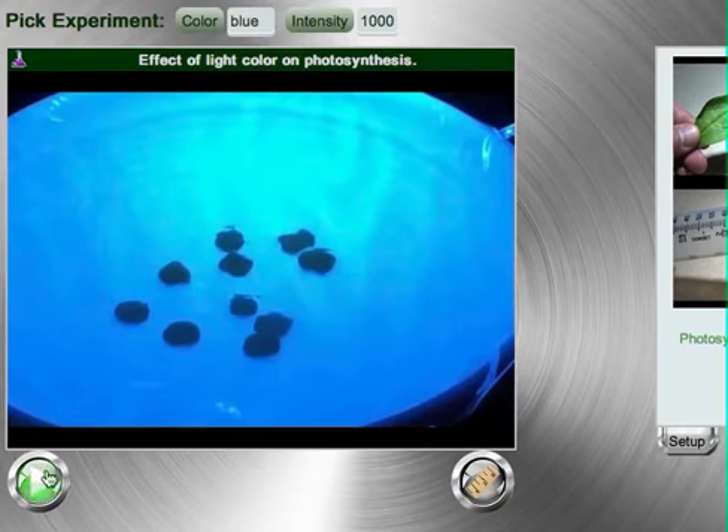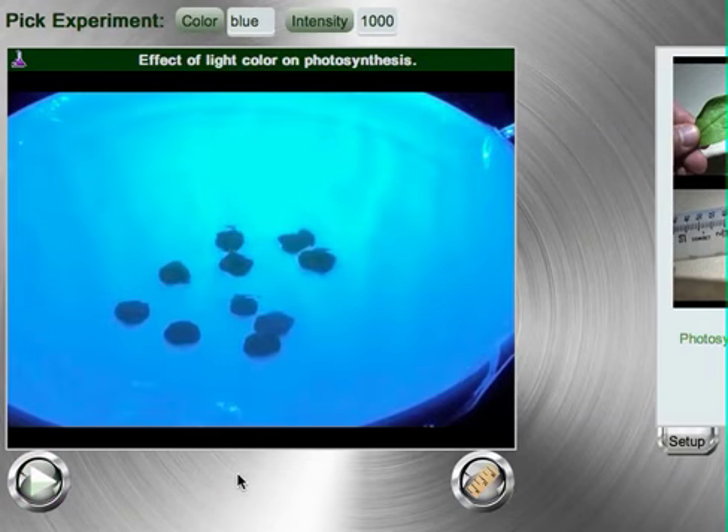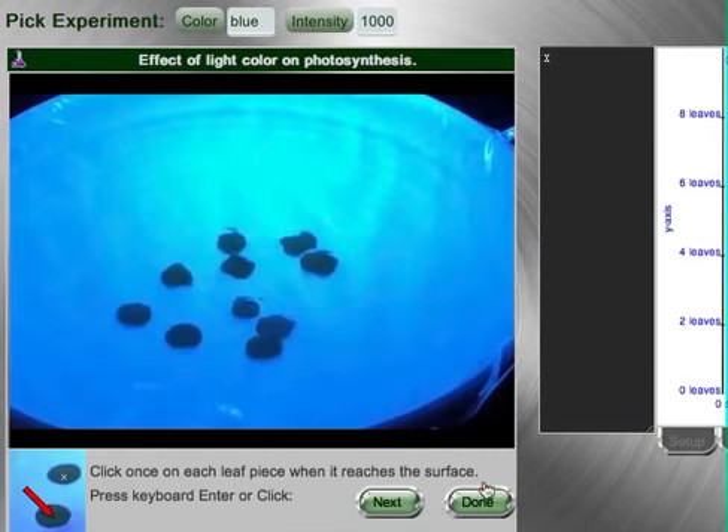When you pick a color, you will then go ahead and press the play button to watch a video of the experiment. Notice, as I watch the video, the disks are floating up to the top. And once you have watched this whole video, you may then press the measure button to start getting data.